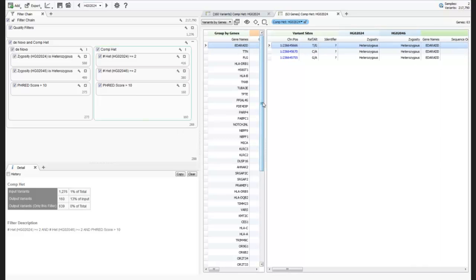Depending on your workflow, there are additional customization options. For example, instead of using zygosity for de novo identification, you could use the allele count algorithm to count the number of hets present — with two samples you want two hets, with three samples you want three, and so on. There are a variety of ways to customize workflows within VarSeq so it can handle families not just in trio format but in multiple different family structures.